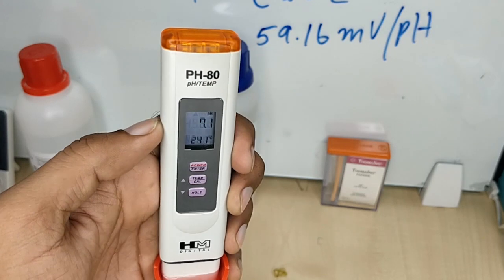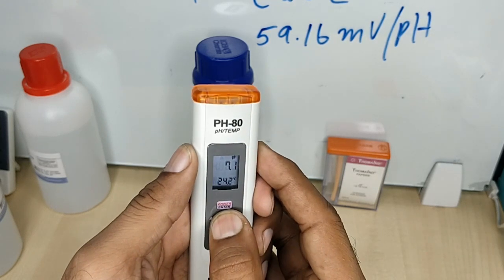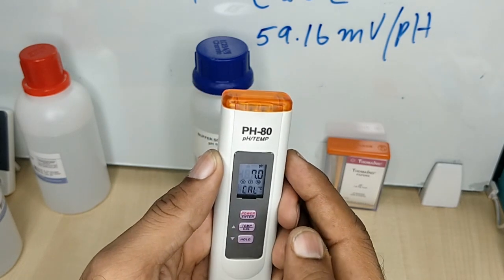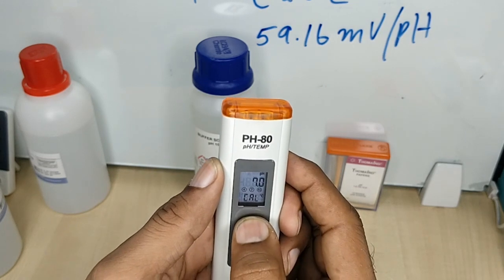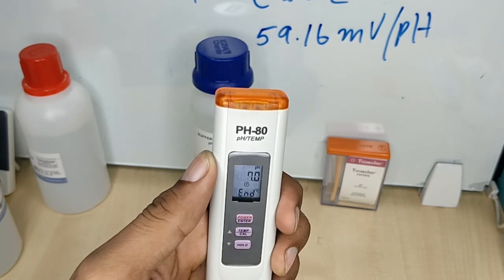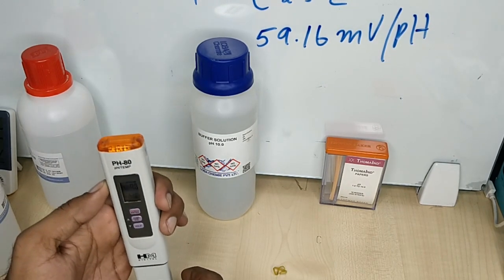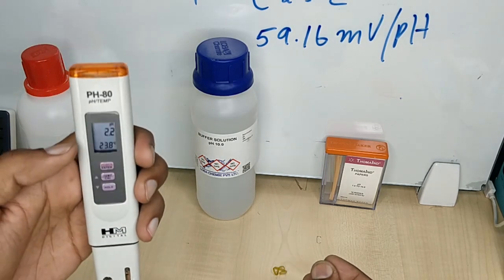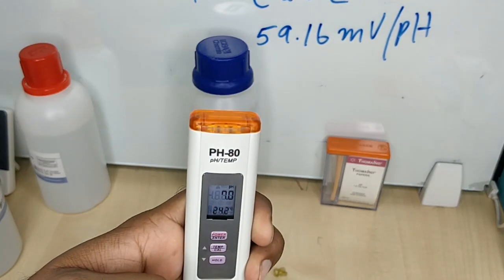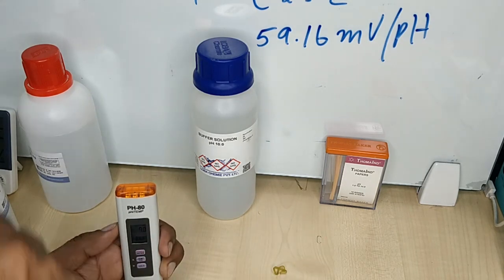The solution is 7.0 and the reading is about 7.1. We wait for it to stabilize — if it does not stabilize we will calibrate it to pH 7. I press the cal button and it identifies the solution is 7. I press enter to calibrate. Calibration is complete — the solution is standard pH 7 and the meter is now calibrated for pH 7. When I dip it back it reads 7, confirming successful calibration.